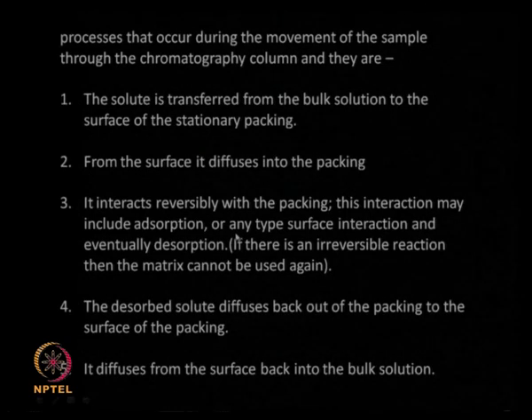So there is an interaction between the surface and the protein, and of course later on there is going to be a desorption of this solute. It diffuses back to the packing surface, so it diffuses back to the top of the packing surface, and then from there it diffuses back to the bulk solution.